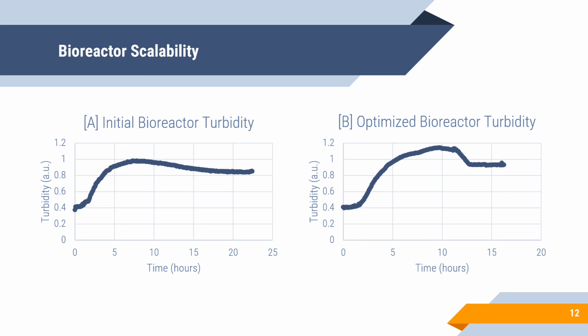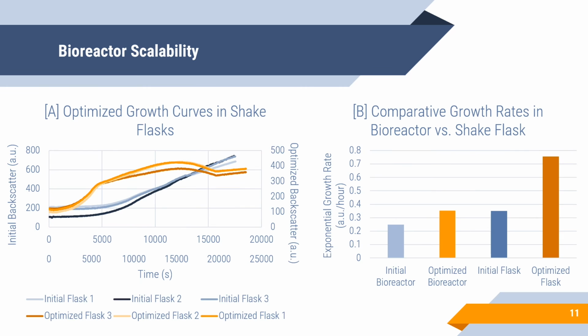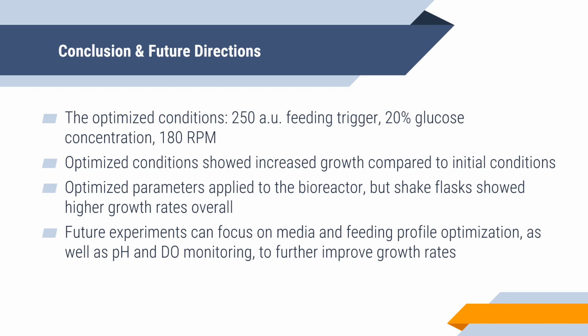The optimized conditions show the increased growth rate compared to initial conditions in both bioreactor and shake flask. However, shake flask showed higher growth rates overall. Potential future directions can be focusing on media and feeding profile optimization, as well as pH and DO monitoring to further improve growth rates.